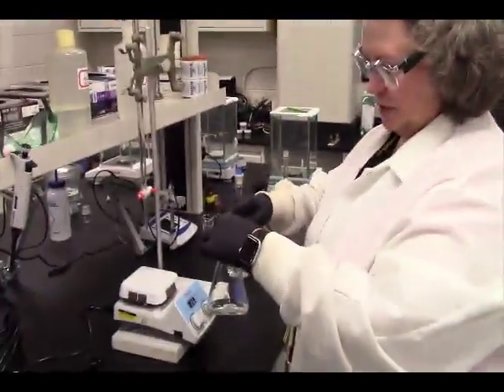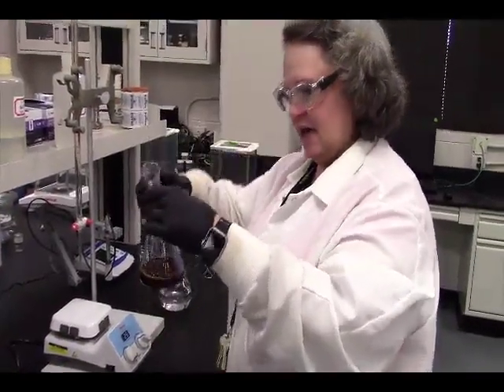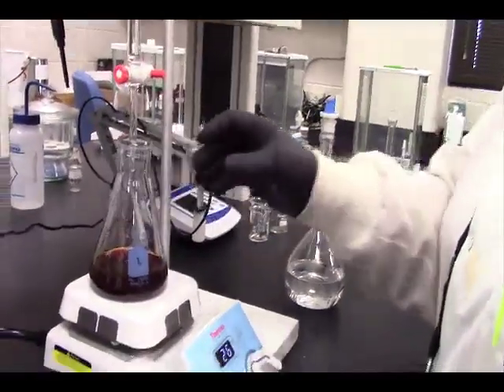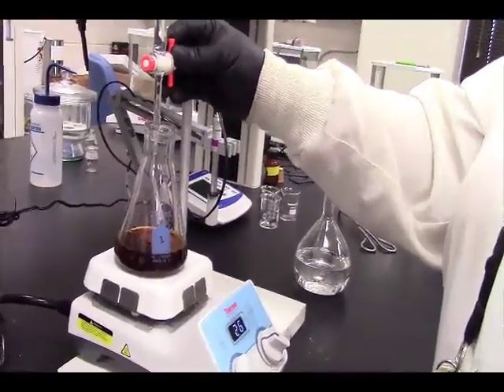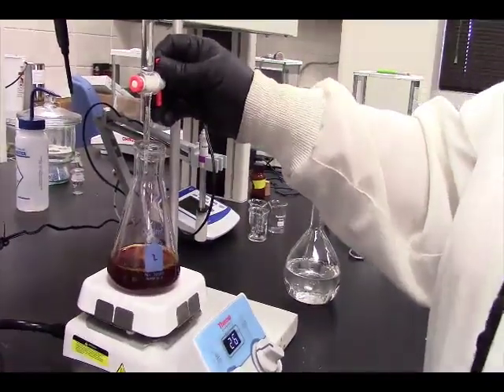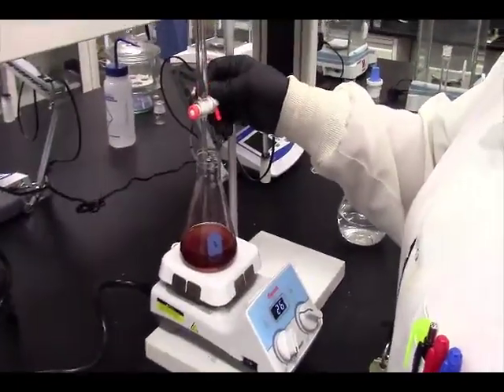Welcome back. We have our last sample of the brand name. And so this is our 25 milliliter of our stock solution. To that, we're adding our 50 milliliters of the acidified KI. This one you can see looks a little different because it's the brand name, so it's a little muddy, almost, if you want to call it that. All right, now we've done at least three of these. We know the volume that it takes for this amount of hypochlorite or bleach to be titrated, so we're just going to go ahead and drop down to about the volume we need. We're going to stop just shy of. This particular titration, though, is pretty easy to tell unless you're doing the brand name, because apparently it does a little bit weird stuff.